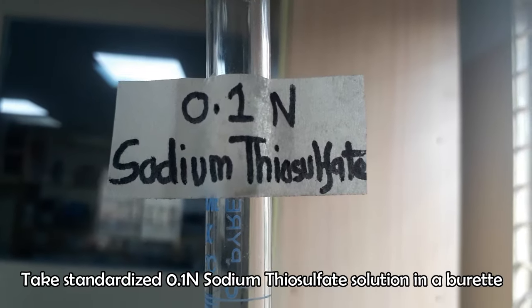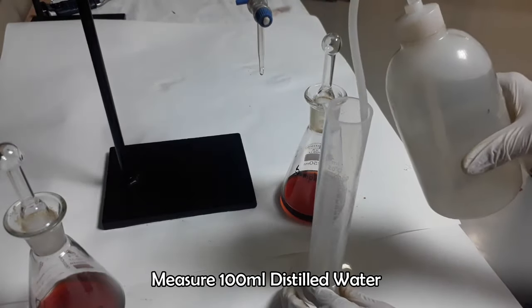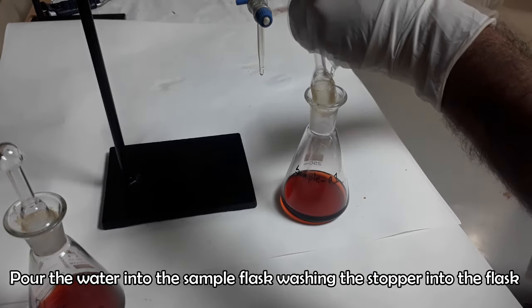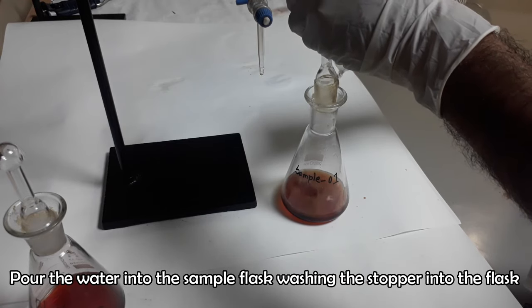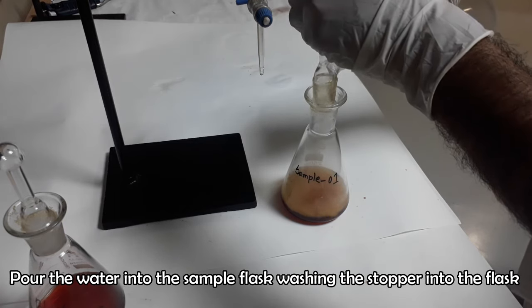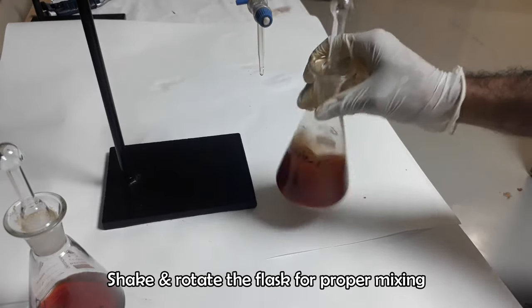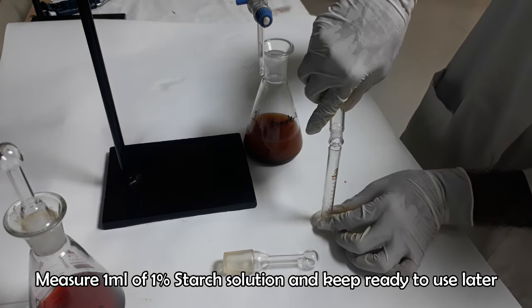Take 0.1 normal sodium thiosulfate in a burette. Take the initial burette reading. Add 100 ml distilled water into the sample flask, washing the lids, and shake the flasks again. Measure 1 ml of starch solution and keep ready to use later in the titration.